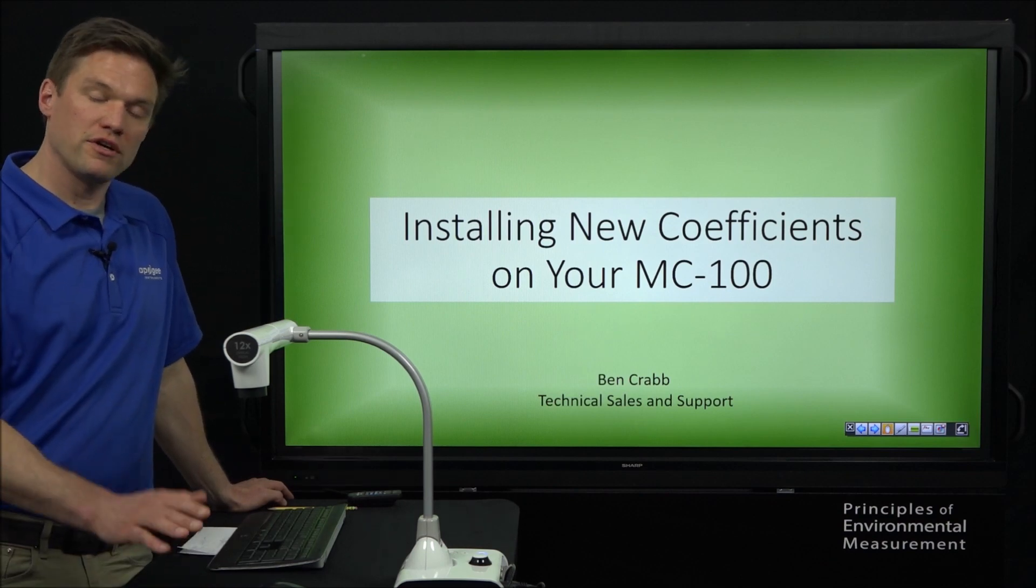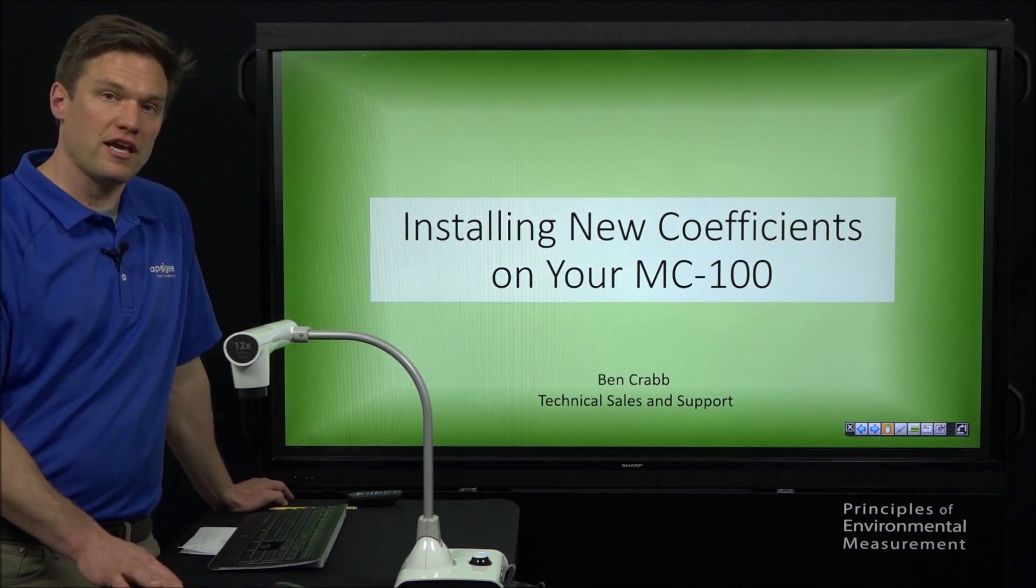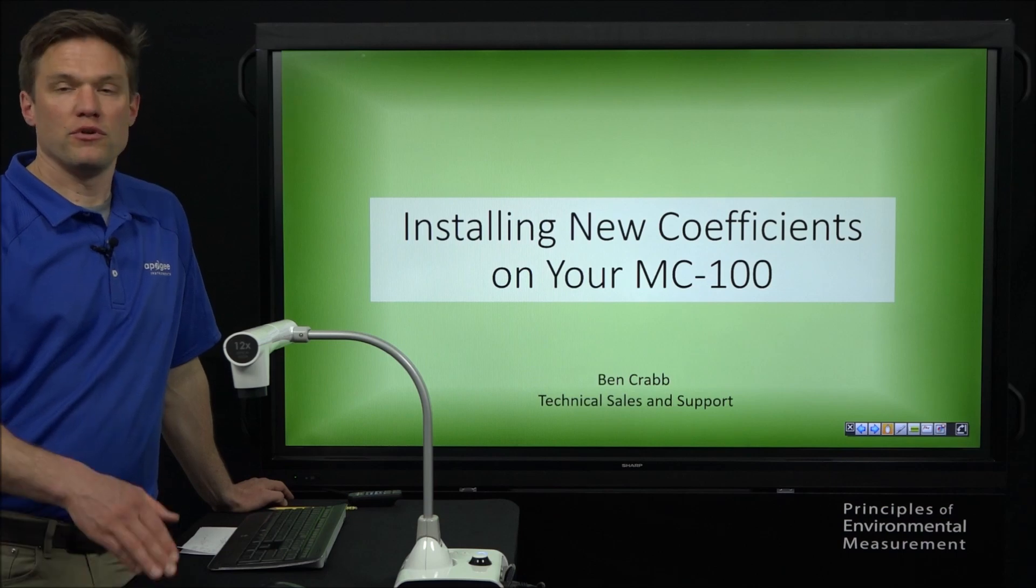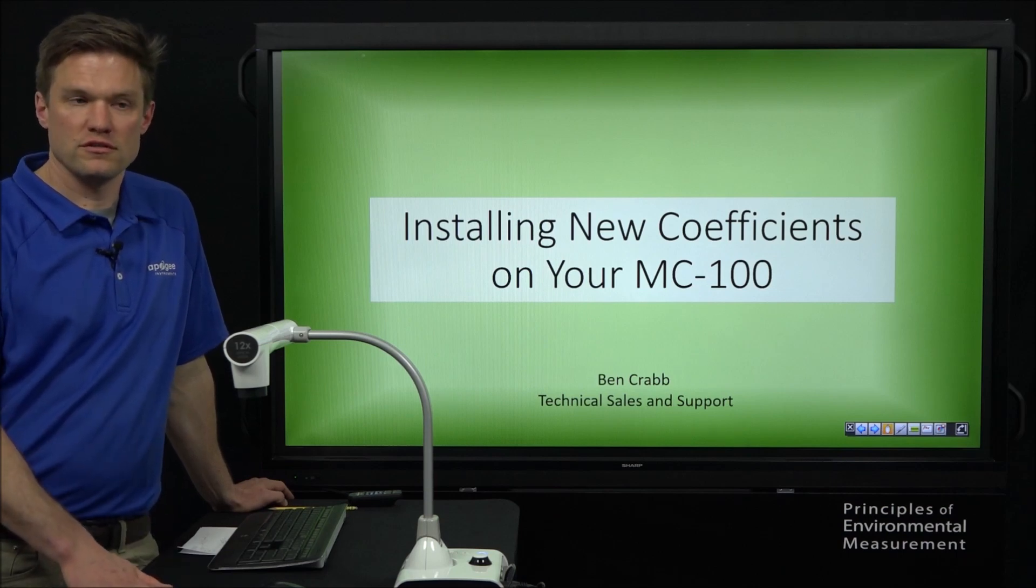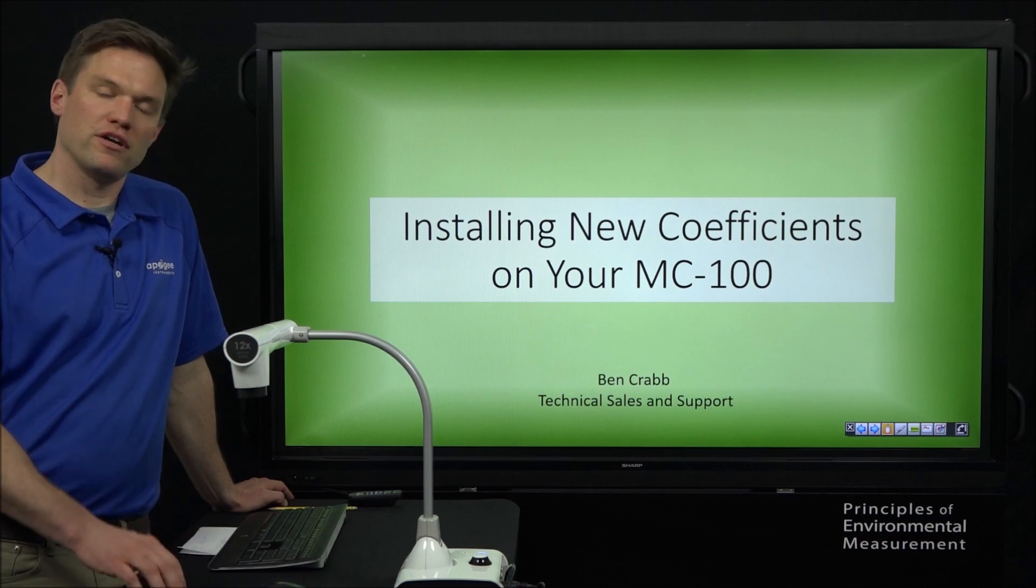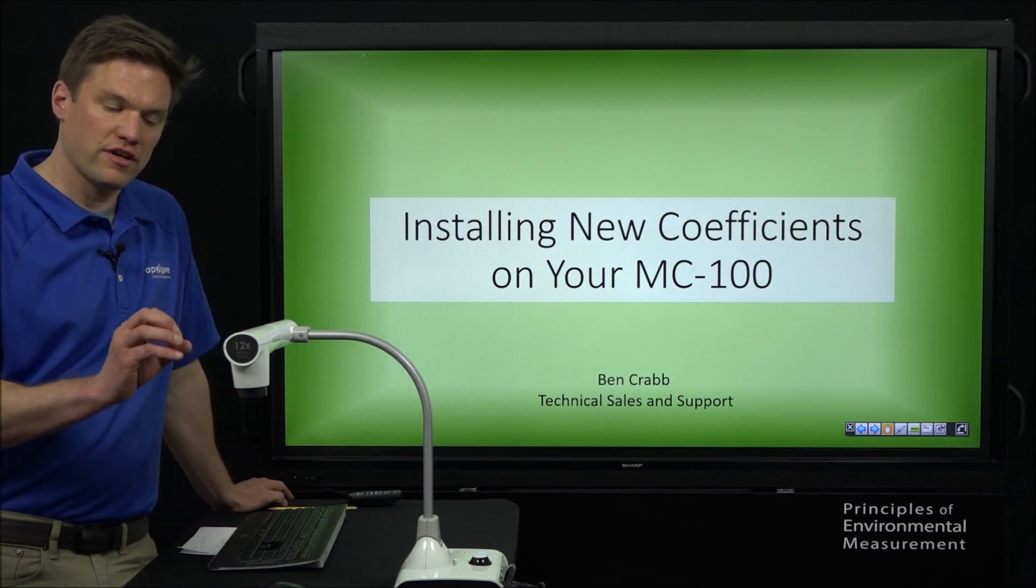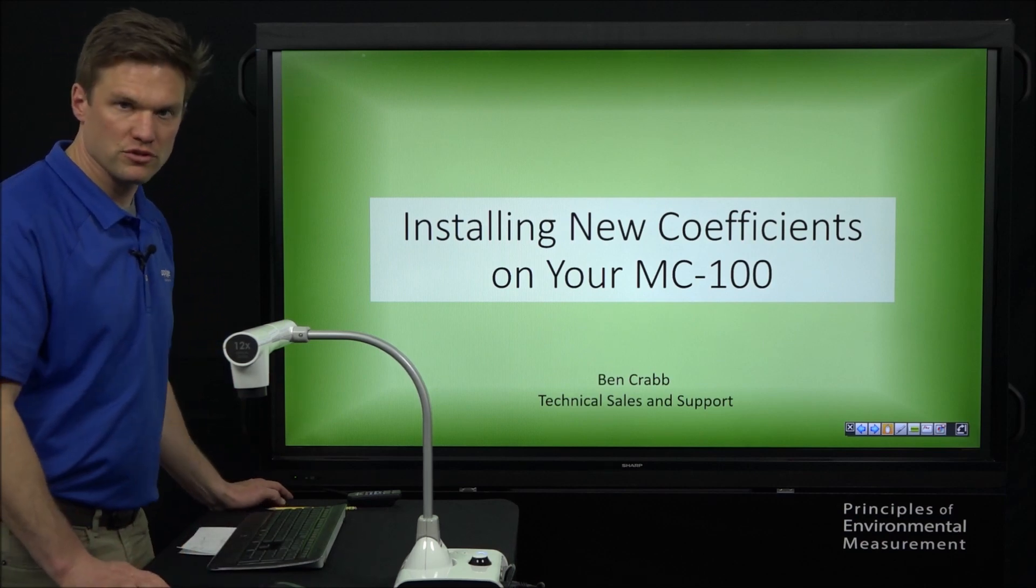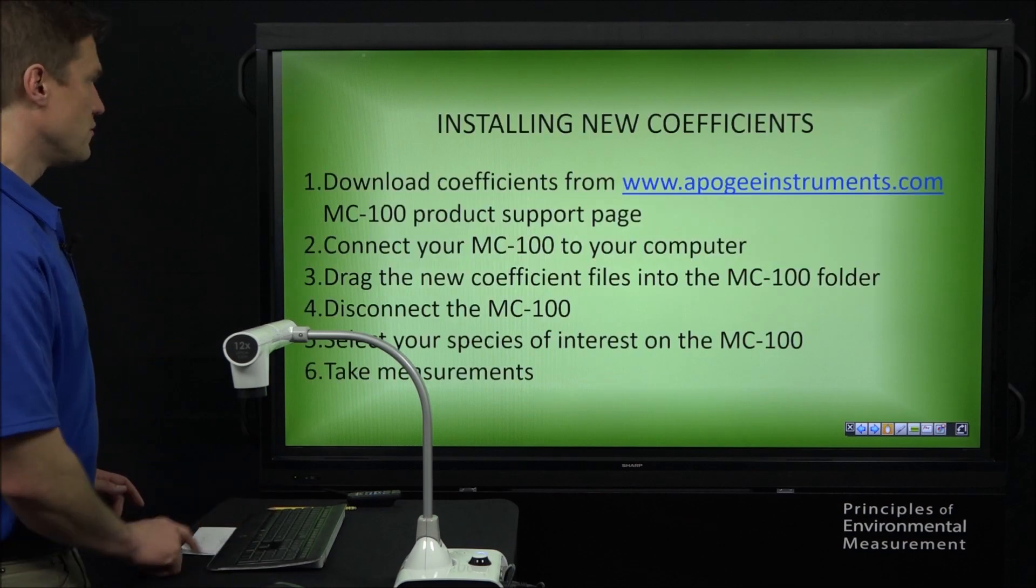What inspired this process is that we have some new coefficients for cannabis and for grapes. But in the future, as we have new species with new coefficients, you can use the same process to access those new files, add them onto your meter and get the most accurate measurements you can.